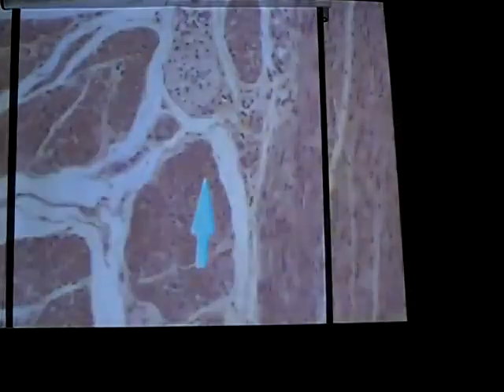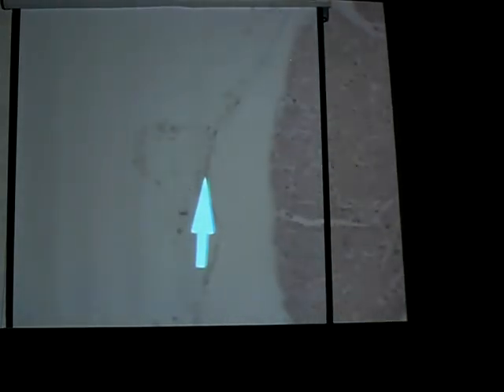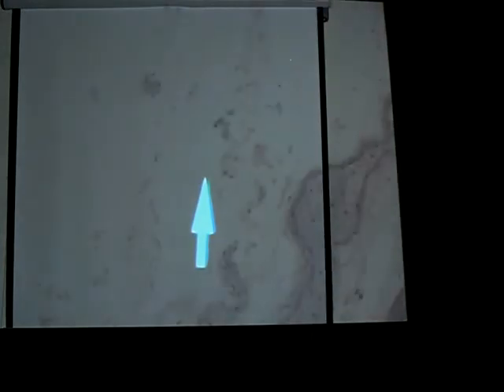Okay. Alright, so this is our esophagus here. And if we look at the end here, pretty much we have some connective tissue. We're not really seeing a simple squamous lining here. So if you don't see that, then that's your adventitia. Oh, no, we do. I thought I saw it.